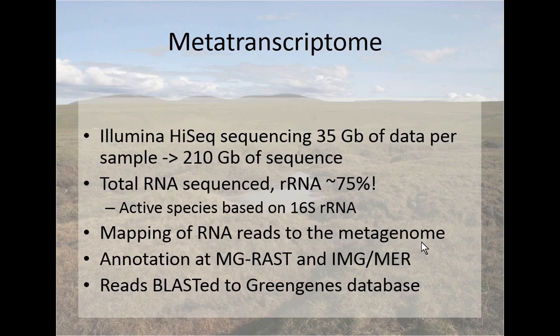But because I had so little RNA, every time I tried to do something with the RNA, it just vanished, because the permafrost RNA for some reason couldn't be heated at all. And most of the depletion techniques require heating. So then I just decided to sequence it all.